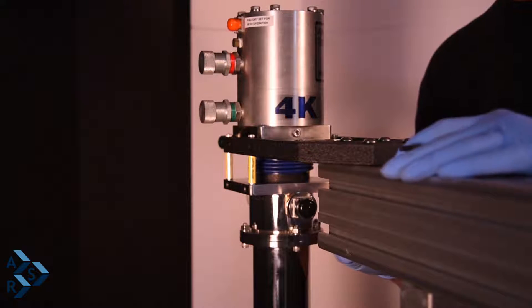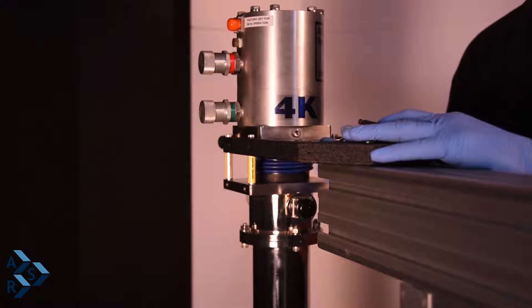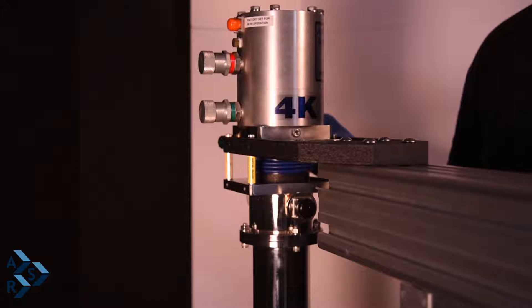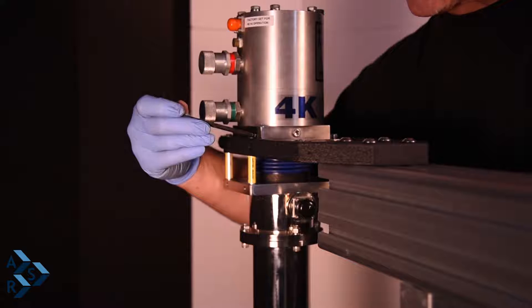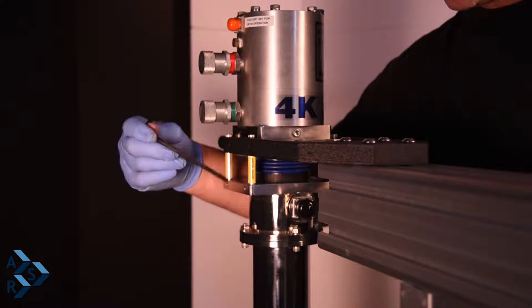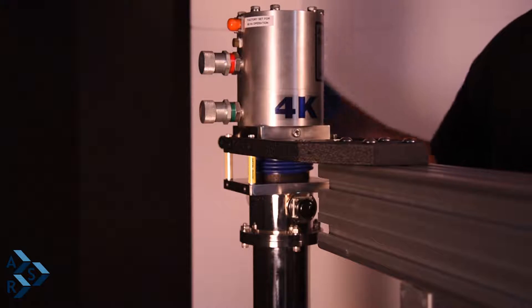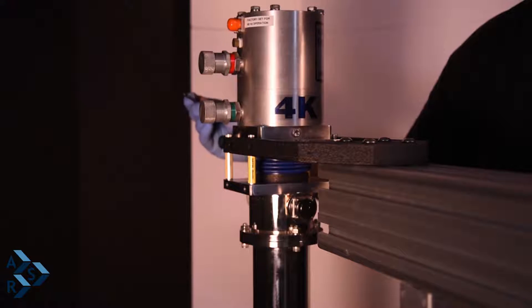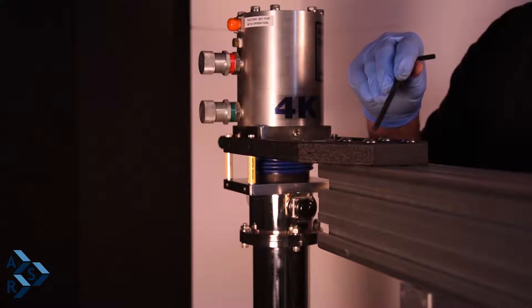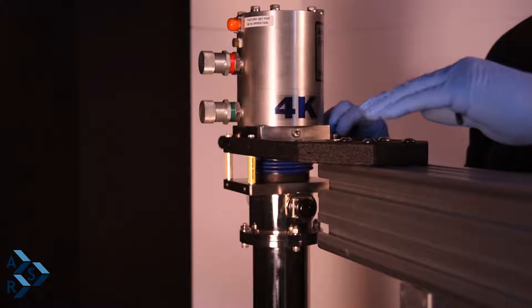We're going to set the stand in relationship to the air table. The fork goes on the top side of the cryostat to separate the cryostat from the interface. We're going to move this fork closer in where we have four quarter-20 screws on the side of the cryostat. We'll fasten those screws for stability, and these here are five millimeter screws which we will finish tightening once we get this set up properly.